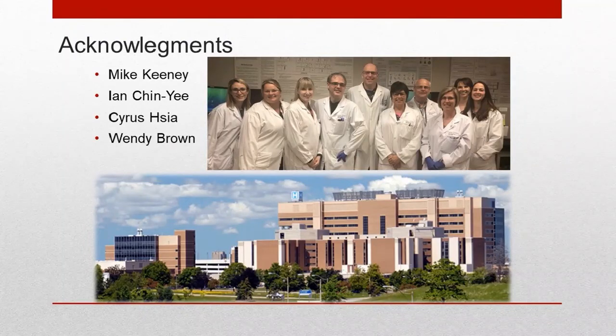And the templates have almost every single thing that you could imagine as far as gating is required. Whether you need all of them to report, that's a personal preference, but they're provided, so you can obviously change them at your will. I don't know, Beckman Coulter would be able to answer the questions on whether you could change the template and whether that would affect your IVD status. I'm not sure. But yes, they're provided by Beckman Coulter. They're very easy to use, and they work for the control cells as well.